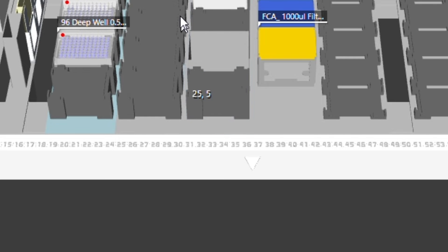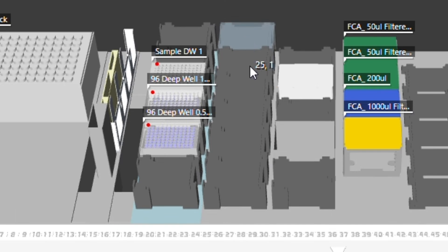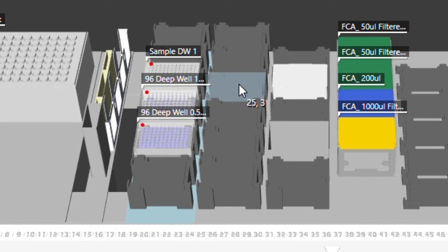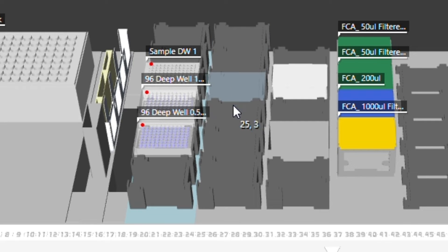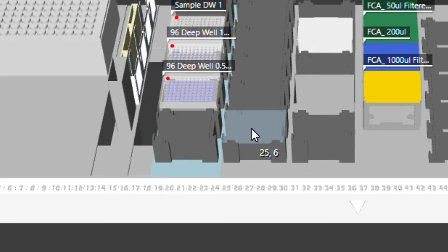And then sites are the positions from top to bottom of the carrier, right? So this is site 1, site 2, site 3, site 4, site 5, site 6.